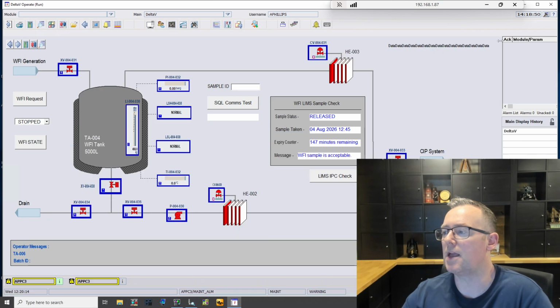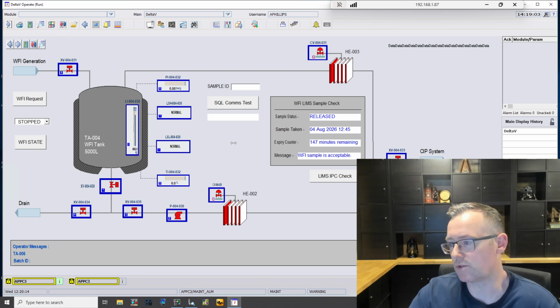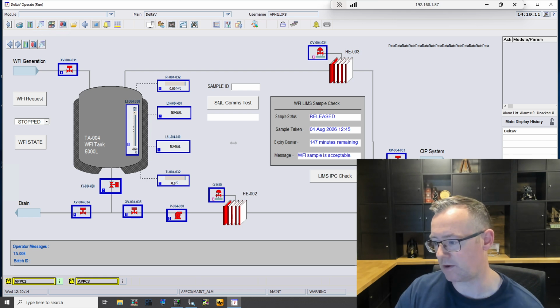For anyone who's used Visual Basic for Applications, probably the most common one is Microsoft Excel. There's an awful lot of Microsoft Excel examples out there, and basically the same environment is in the background here.